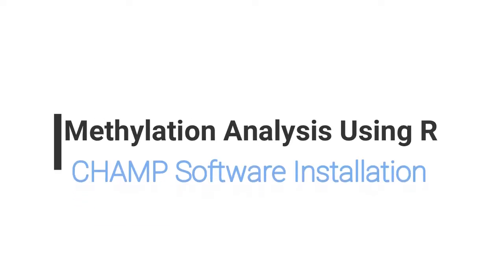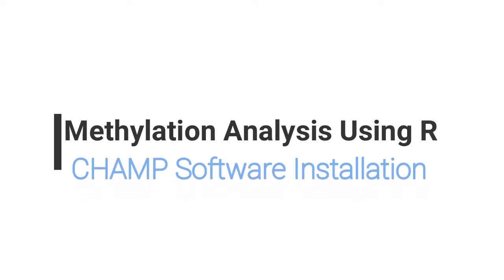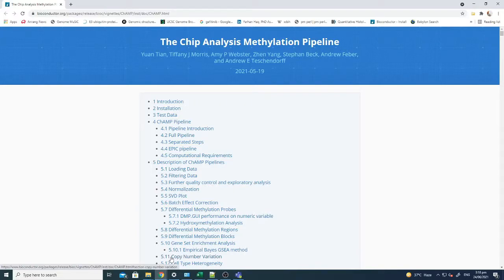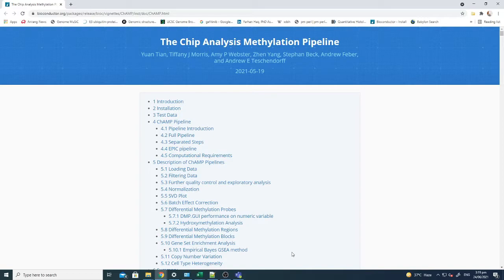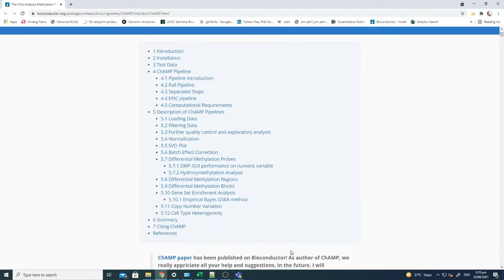Hello everyone, in this tutorial we will talk about analyzing chip methylation data using R bioconductor packages. The most frequently used package for methylation analysis is known as CHAMP software. CHAMP stands for Chip Analysis Methylation Pipeline.